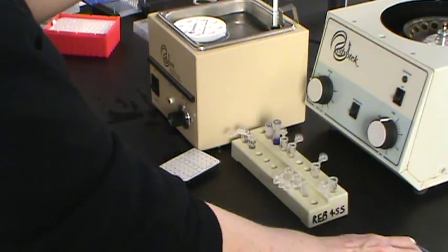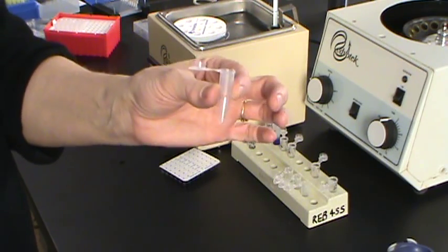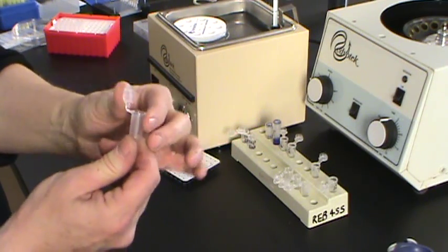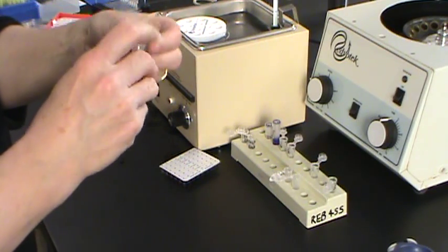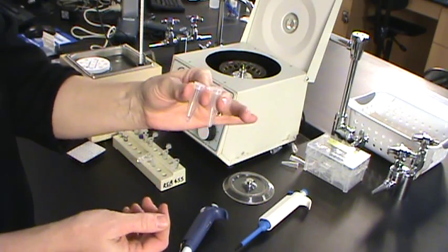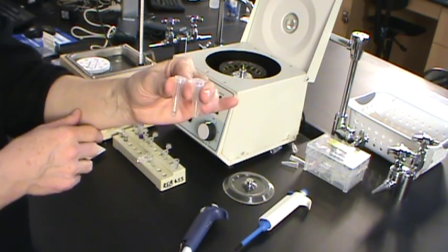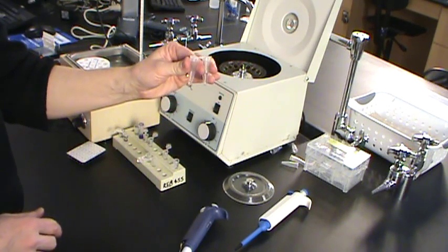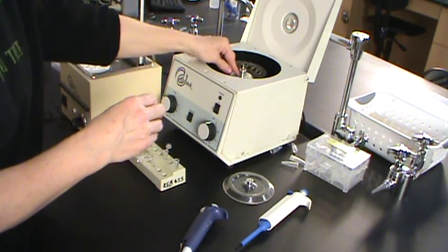Well, now we have this sample, but we've just put in what seem to be just drops of material. We need to make sure that everything is mixed so that it will react. So we can close that, and we've got two samples here. I've done another one earlier. So we have these two microfuge tubes that have sample in them, but we've put such small volumes in that the material may not have all gone to the bottom of the tubes. So one of the things we can do is tap that on the bench, or we can use one of these microfuge centrifuges that are here.